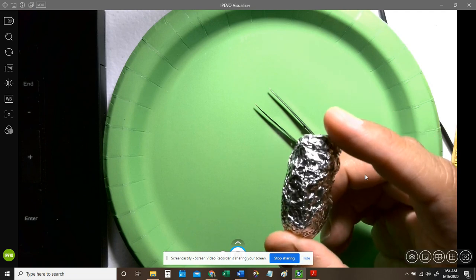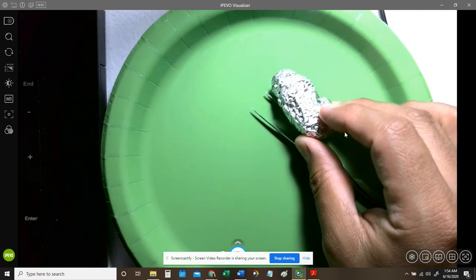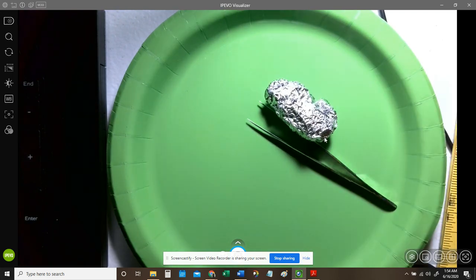Depending on what the animal ate, you can do easily two of these per group, depending on the size of your group, as well as the amount of owl pellets you have. Usually, if you order them through Wards or Carolina, you will be able to get large packs of about 50 or 100 owl pellets at a time. So if you are able to continue ordering them every year, that's an easy thing to do.